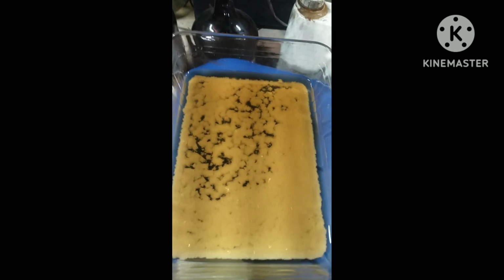Anyways, once it's done boiling and dissipating the hydrochloric acid, I put it into another dish, and then you're going to want to put it in the freezer or let it stay out so it can crystallize.